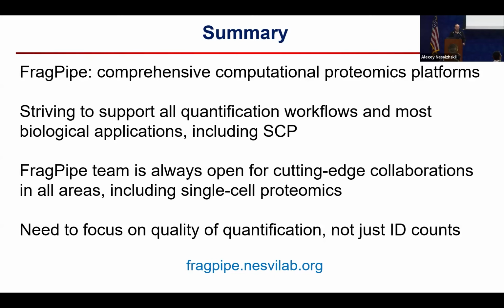And often in proteogenomic studies, and we do a ton of proteogenomics as part of the CPTAC consortium, we often end up summarizing to the gene level, not to deal with the problem, especially if you integrate with RNA data. Of course, if you really need to resolve between protein isoforms and so on, you have to deal with this problem, and it becomes a bigger issue, and you have to find what works for you. But at least in FragPipe, we have a consistent way to assign peptides to proteins. Consistent given the evidence that we have. Unfortunately, we often don't have enough evidence, and we just have to present the ambiguity to the user in the most transparent way possible.